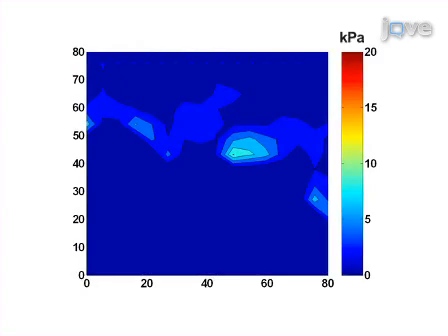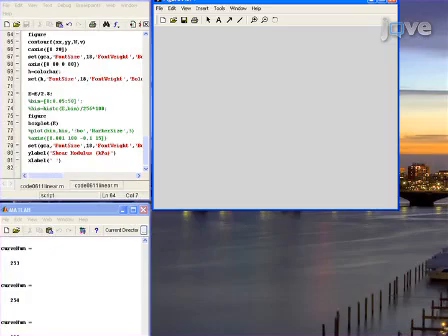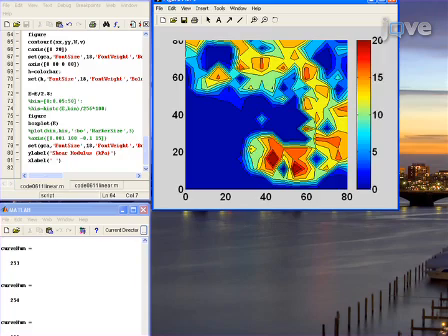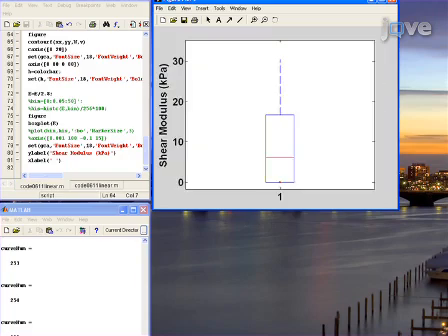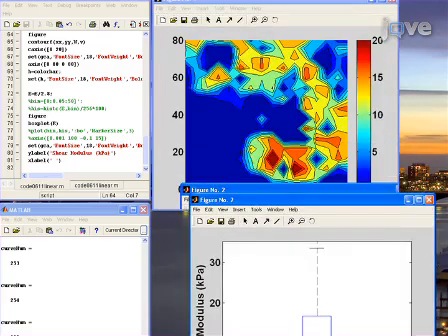To visualize spatial patterns of stiffness collected in force map mode, plot modulus data in contour maps, for example in a 16 by 16 grid covering an 80 micrometer by 80 micrometer area. To process a large amount of force curve data, a custom algorithm may be written to automatically fit force displacement curves, extract moduli, and/or plot contour maps or elastographs using the same procedures and parameters just described.